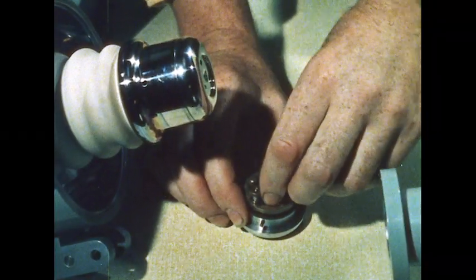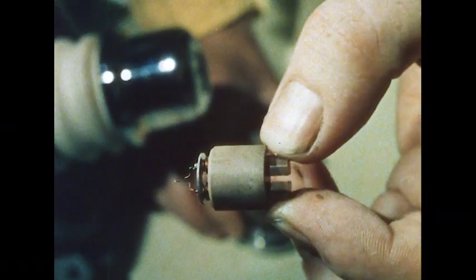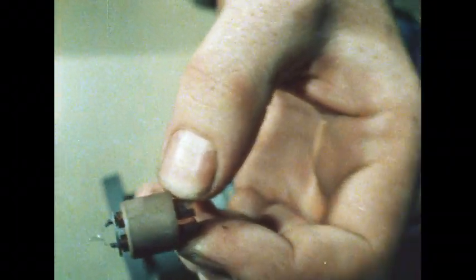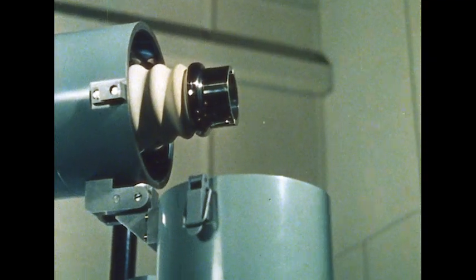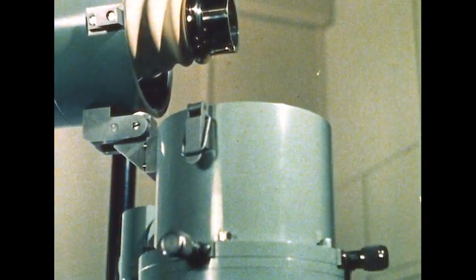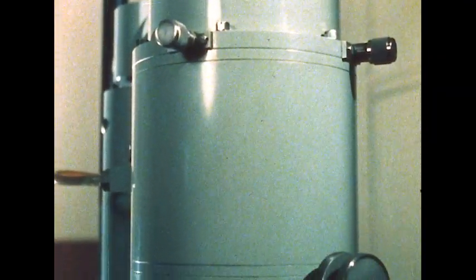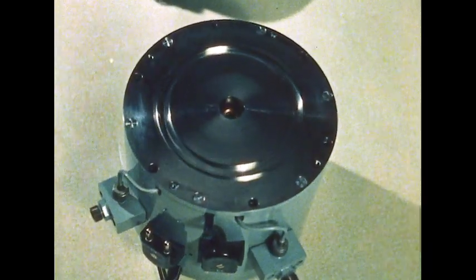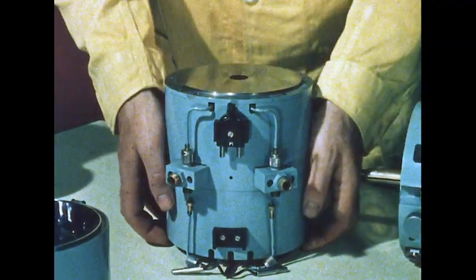The electron beam is emitted by a heated V-shaped filament mounted in the cathode. Electrons are attracted to the highly polished anode. They pass through the hole in the anode plate and on down the column. Below the anode plate is the condenser lens, which focuses the electrons onto the specimen. All the lenses are simply electromagnetic coils in metal cases.